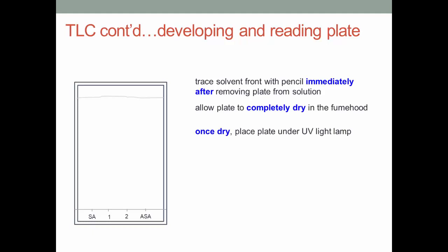Once the plate is dry, place it under the UV light lamp. Outline the dark spots that appear on the plate with a pencil.